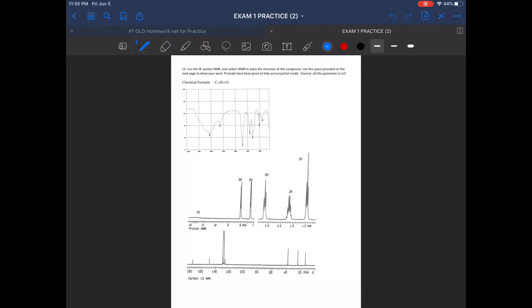Okay, let's work some NMR problems. In this video, I'm going to work through the NMR problems on the practice exam on eCampus. If you're in my Summer 1 2020 class and you previously downloaded the practice exam, go back and grab it again. I replaced it so that there's not a bunch of chapter 16 on it. But okay, anyway, we will jump in.